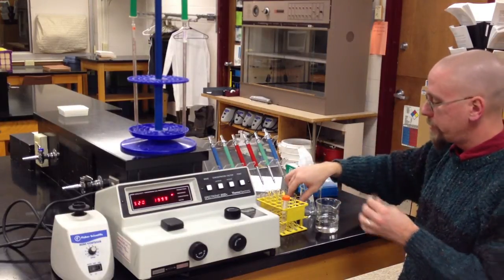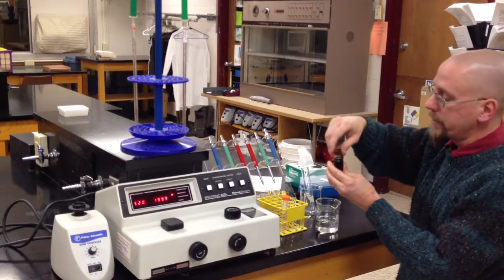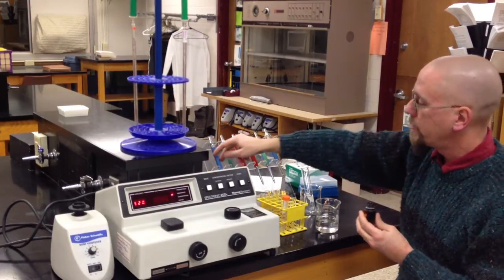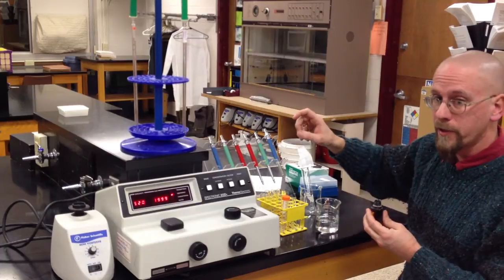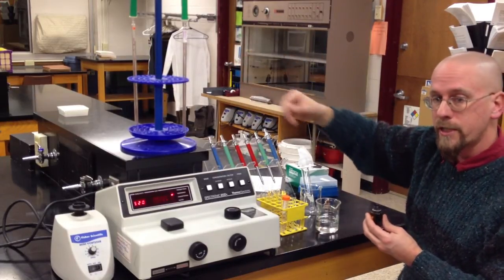Into this, what we're going to do is deposit 100 microliters of iodine. Now 100 microliters is a very small volume. We can't use regular pipettes for this. That's only one-tenth of a milliliter.